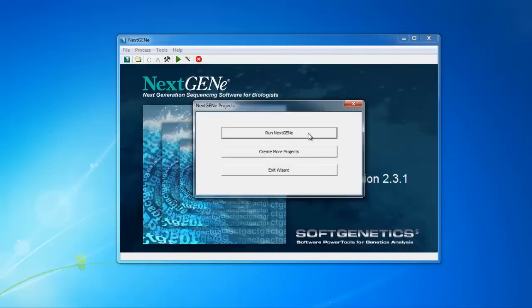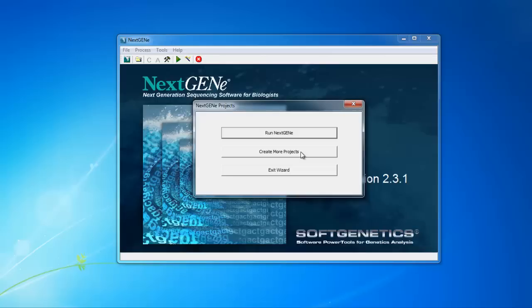Here you can click Run NextGene to begin processing this single project. You can also click Create More Projects to reopen the project wizard and create another project, for instance for an additional sample. You can create multiple projects in this way, then click Run NextGene after adding the final project to begin processing the projects consecutively.